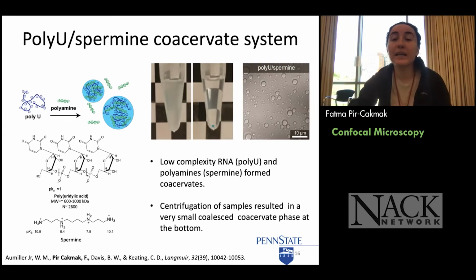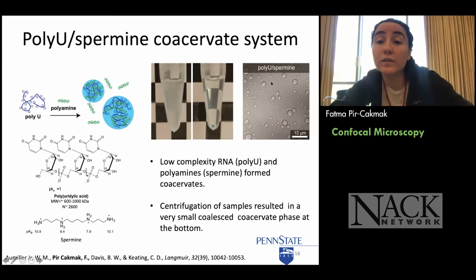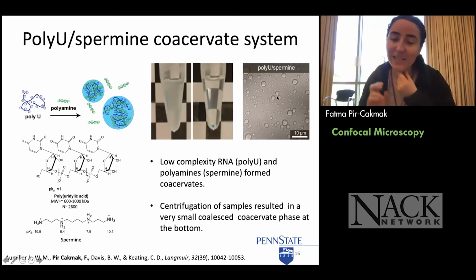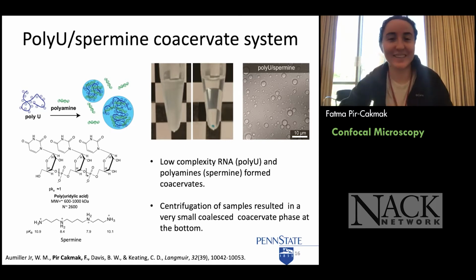And when I mix them, I can form these compartments mimicking what we observe in the cell, in in vitro systems. When I mix them, they look like a turbid solution. If I centrifuge them, they are actually very tiny droplets. And this is how they look under the microscope, these droplets you see here. Let's say condensate droplet, because coacervate is kind of difficult to pronounce. I think condensate is going to help people to say it even easier.